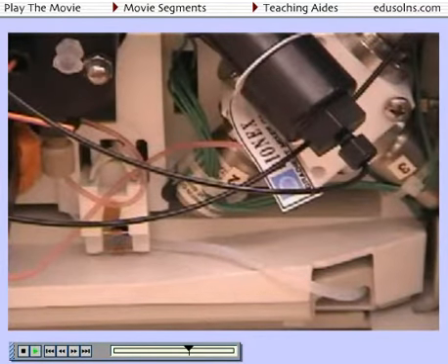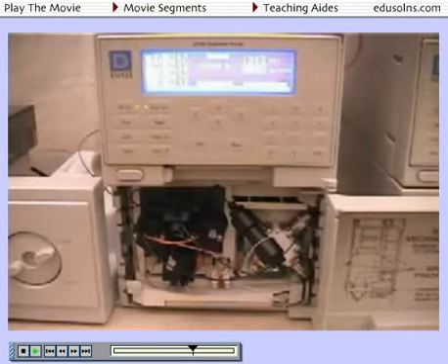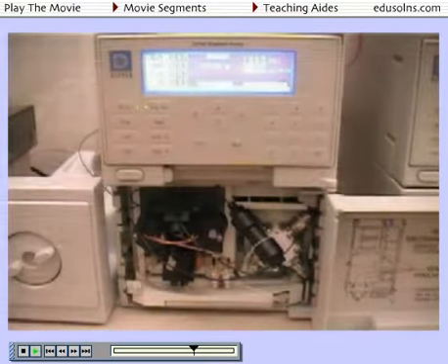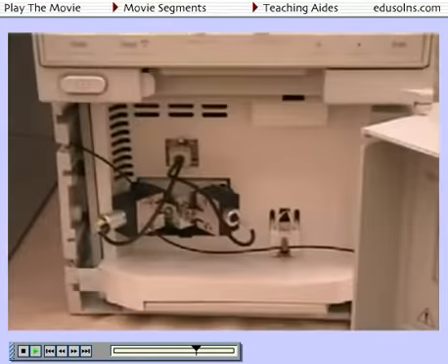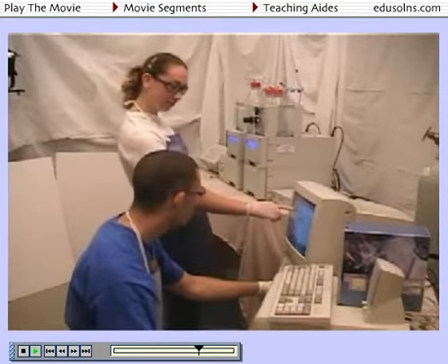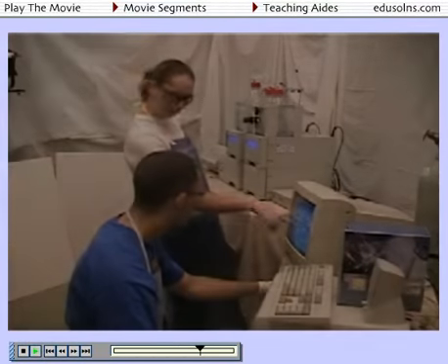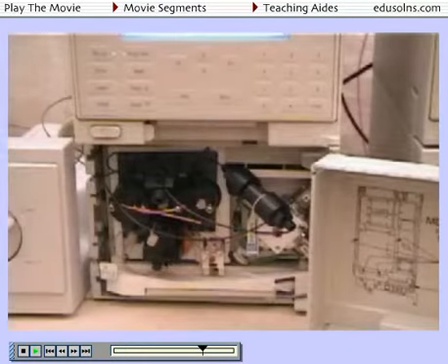This material is important when working with compounds that may be deactivated by metal surfaces, as in the analysis or preparation of enzymes. A variety of other materials have also been used to construct components such as pump heads, pistons, pump seals, and detectors. Pump heads are typically constructed of stainless steel, titanium, or PEEK. Pistons are usually composed of sapphire, but PEEK has been used as well.